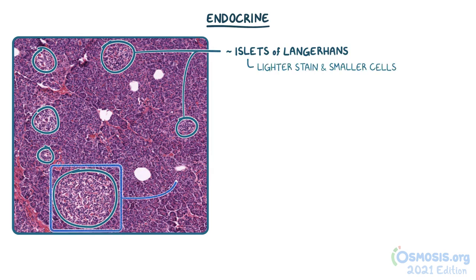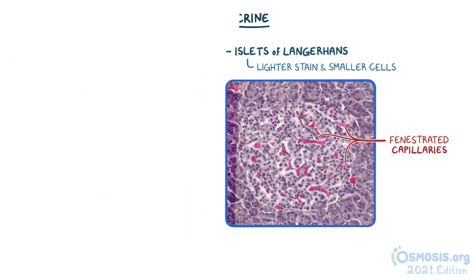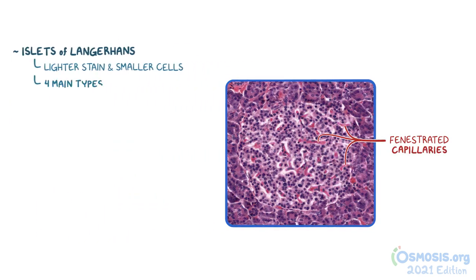When we increase the magnification to 20x, we can see the fenestrated or perforated capillaries within the islets as well. The islets of Langerhans consist of four main types of cells, but they cannot be easily distinguished from one another on slides stained with H&E.